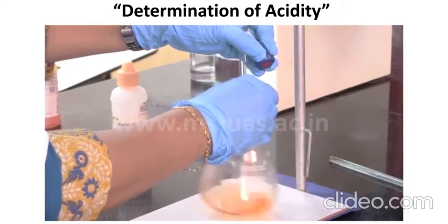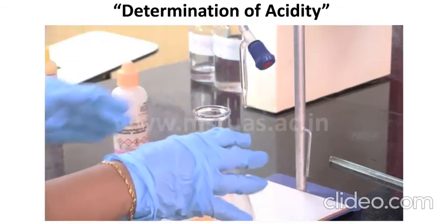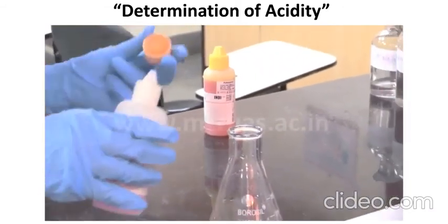Now the solution has turned to orange. Now we need to add 2 to 3 drops of phenolphthalein indicator.